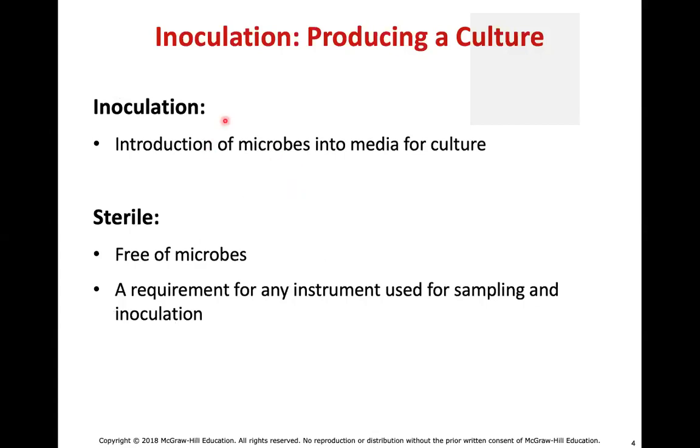Inoculation is the process of introducing the microbes into the media for culture. And generally speaking, when you inoculate a media, you want to do it aseptically. Aseptically means without contamination. And we usually say that this is a sterile transfer, okay? Sterile transfer, your textbook actually defines it as free of microbes. I'm not 100% sold on this particular statement, and I want to point out something. It should be free of living microbes. In reality, you will sometimes have media that is actually made up of dead microorganisms. So they're there, they're just not living.